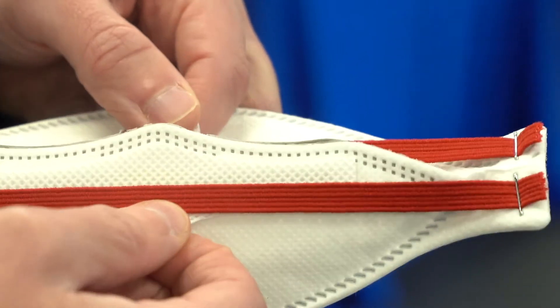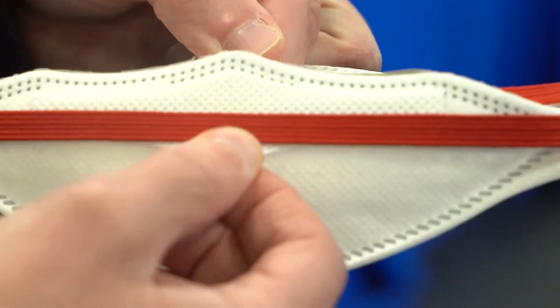We now have these convenient fitting tabs. In the previous model, to open it out ready to fit the face, you would have to get a hold of the inside of the mask, and obviously that's a potential contamination issue. So with these additional tabs, you don't have to touch the inside — a nice little feature there.